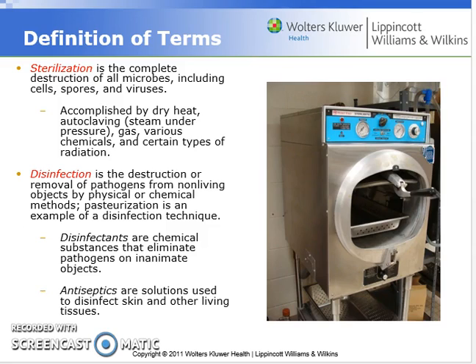To sterilize these items, we place them in a giant system known as an autoclave. The autoclave is very useful because we can insert our instruments and then heat them to an incredibly high temperature to destroy organisms.